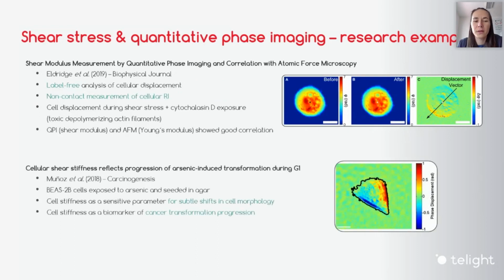From the State Research Group comes this paper, which is really interesting, studies of the lung cells. And first they used non-cancer human lung cells, and they exposed them to arsenic treatment for several weeks to activate their change into carcinogen cancer cells, because arsenic is a typical carcinogen, especially relevant for lung cells.